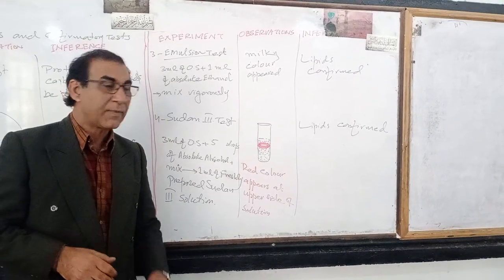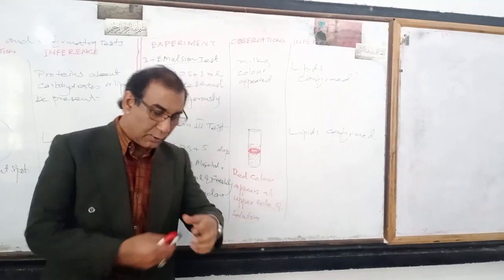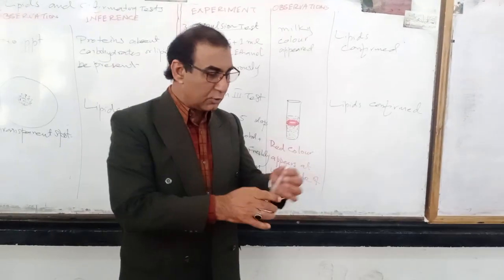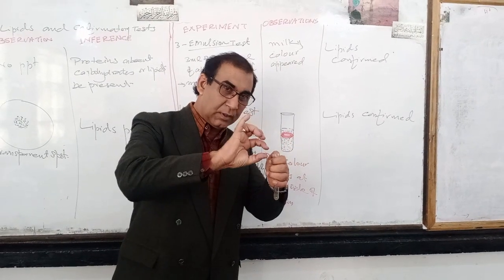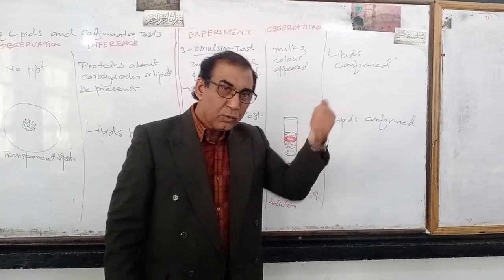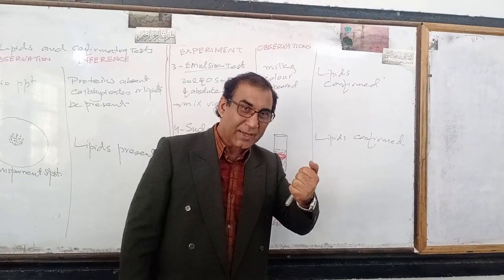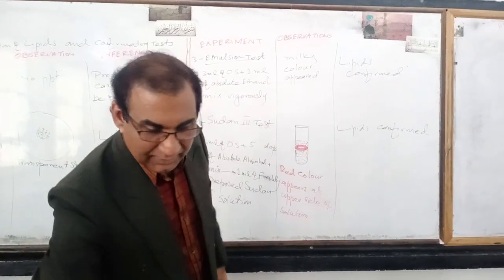Sir, what does vigorously mean? Gentlemen, vigorously means with full power. Suppose this is your test tube. Would you bring that test tube to me? Suppose this is the test tube. You put first the given solution, and then you put the alcohol. And we'll perform it just after a couple of moments. You mix that like this. This is what vigorous means. Vigor means power, force. What is it called in Urdu? With strength. Yes, you can say ruthlessly.